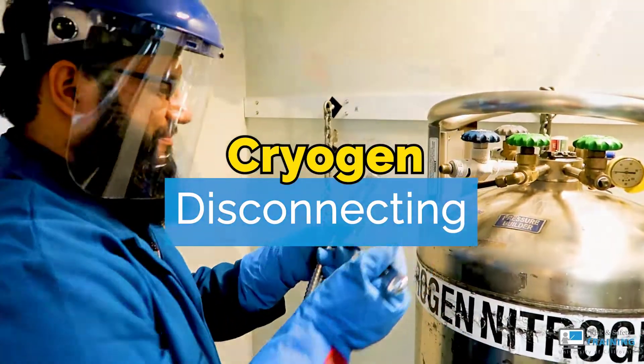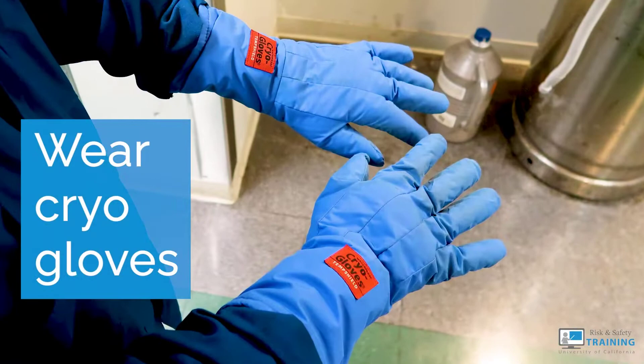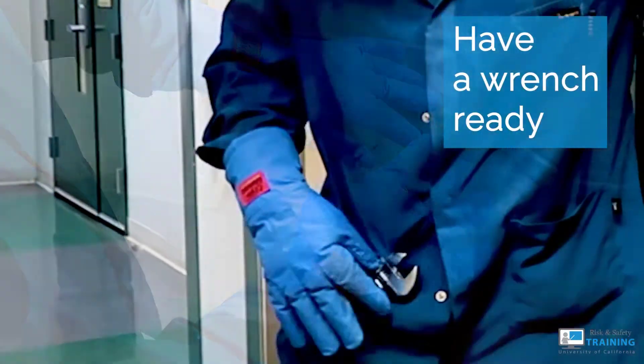When disconnecting a transfer hose from a liquid nitrogen source, make sure you're wearing cryogenic gloves and have a wrench ready.